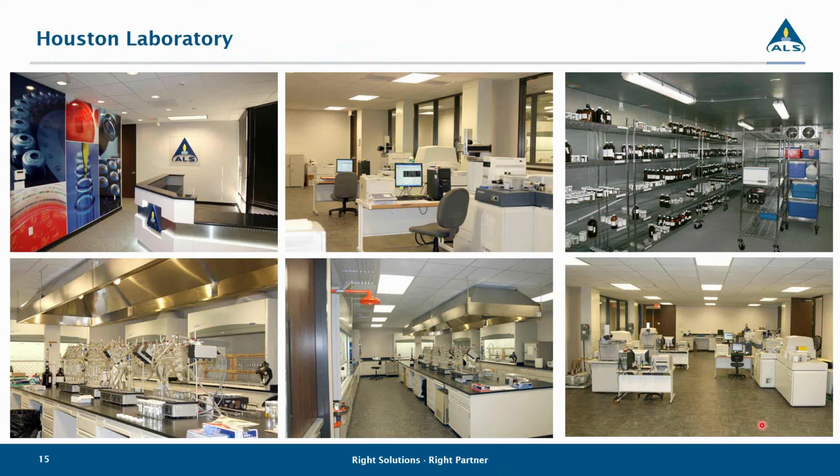Okay, yeah. Catherine, if you have anything further on that, email Nicole, and she'll be happy to work with you on that. We have a question. Sure. We have a question from Julie. Should EMPCs be treated as detects or non-detects?